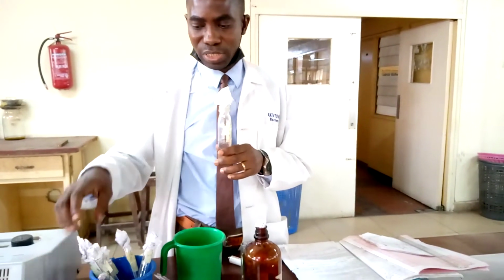To create a serial dilution, we take some amounts from the known. We have some test tubes. We take 0.2, 0.4, 0.6, 0.8, and 1 mil of the known sample.